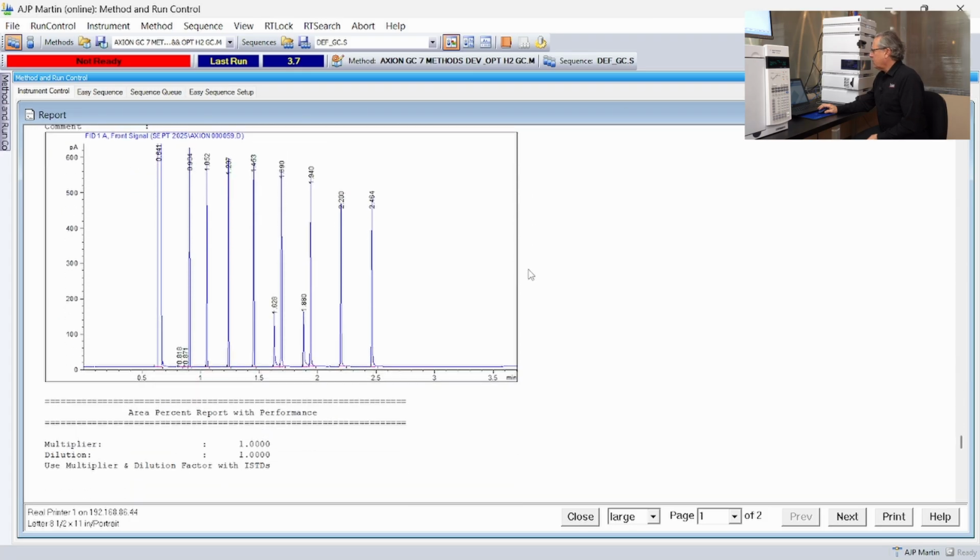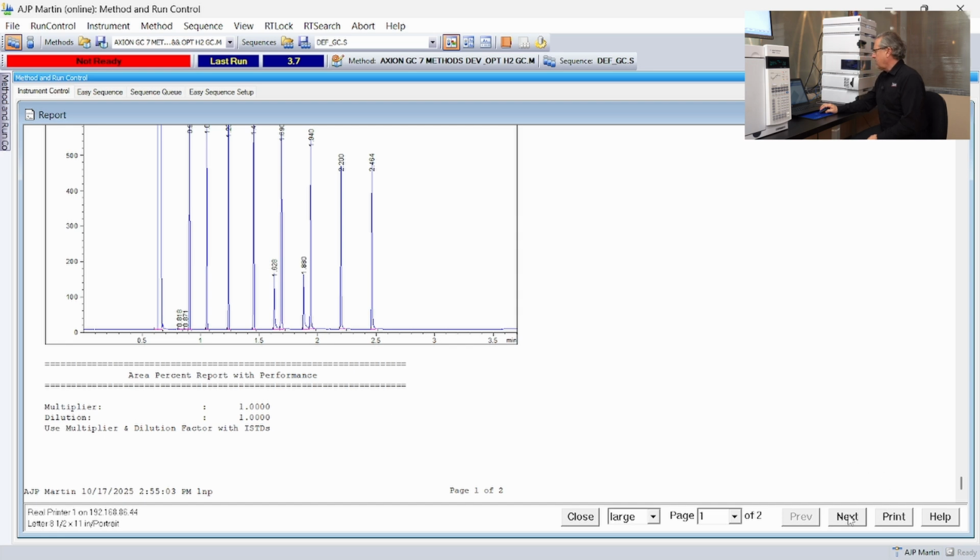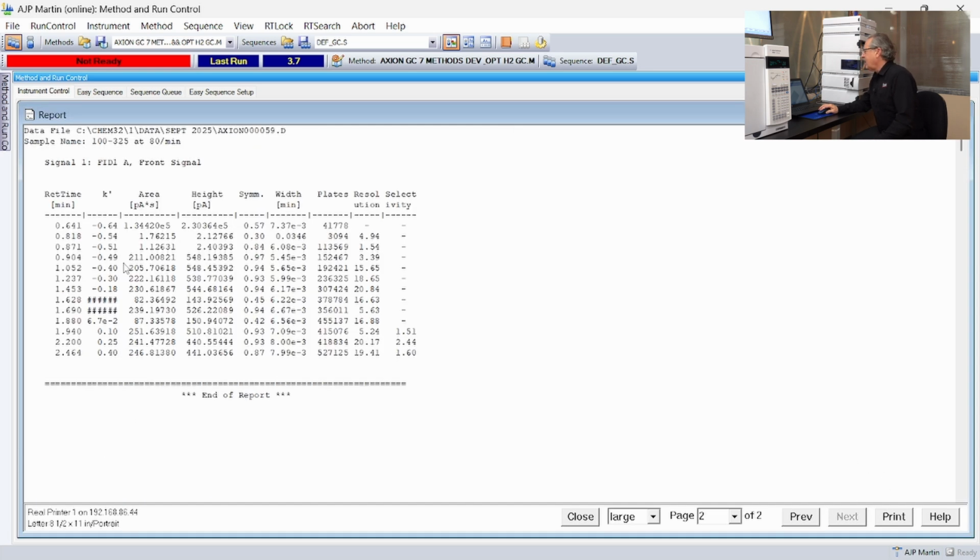So again, we're going to look at our peaks of interest, and the first peak of interest we'll see based on the area. Yeah, so here's our first peak of interest, has an area of 200. We come over here and we look at our resolutions. So, starting with this guy, there we go. So we have resolution of 15, 18, 20, 16. So we got a 5.5 and a 5.2. So those are our lowest ones. Those are the alcohol, what I call the critical pairs.